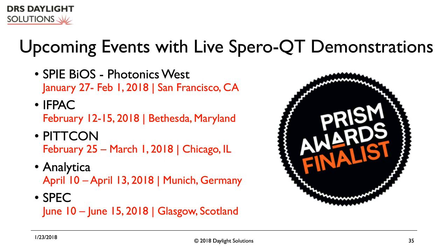Bill, this viewer asks, so does the laser scan all the pixels at each wavelength? The laser at each wavelength scans the full field of view and collects that as a single image. Wavelength by wavelength, it does that and stacks those images into a hyperspectral cube, which then can be queried pixel by pixel to pull full spectra of that pixel out.